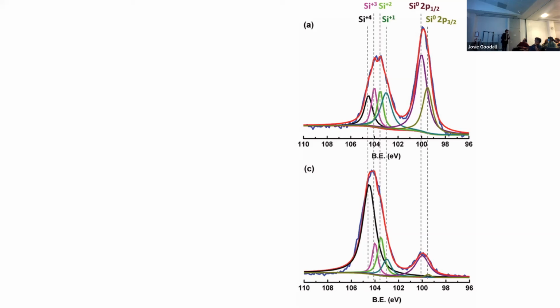Right, but then you would just integrate it. But let's suppose you do want to fit it for some reason. Would you consider fitting the silicon oxide peak with a symmetric peak? So if you want to pick up different chemical environments of silicon, you mean, for example? Yeah. You probably could get away with it.